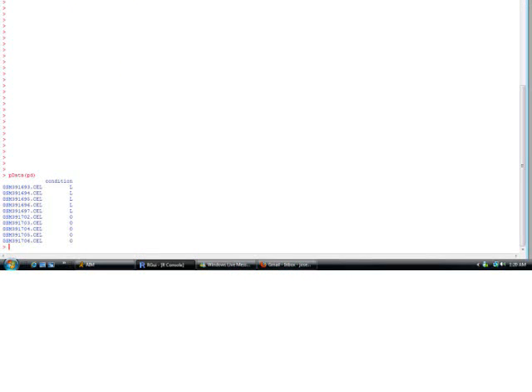Now when I call on that using pdata pd, pd is the phenotype data, what I called it. You can call it anything you like. You can actually spell out phenotype if you like. But that will display the exact tab delimited file that I just showed you a second ago, and that shows you that it was all read in correctly.